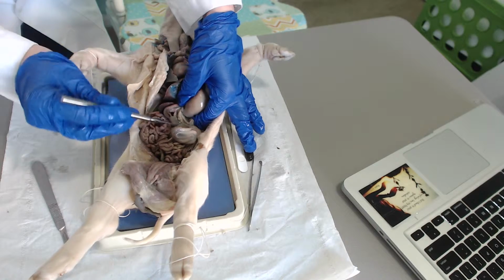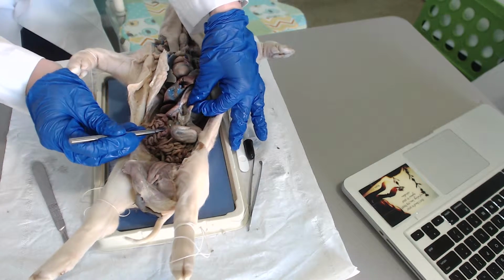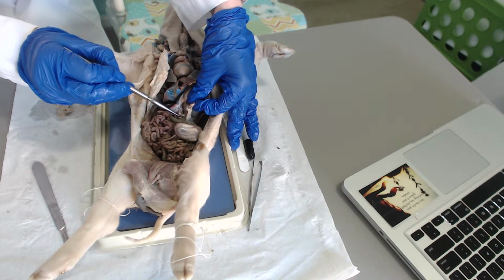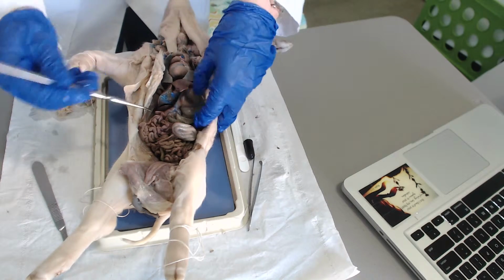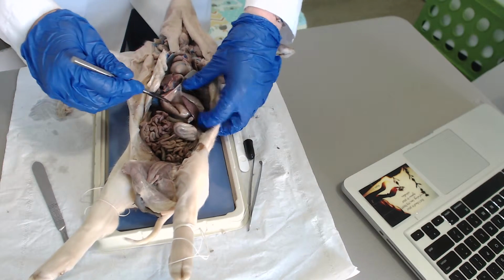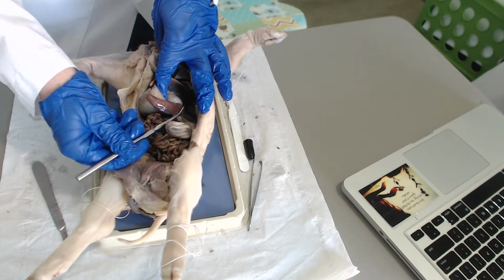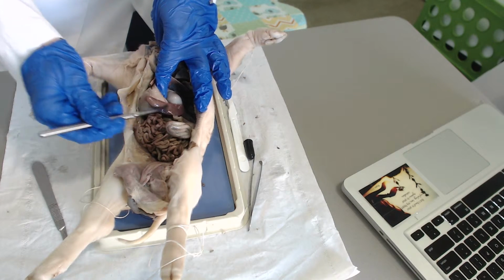Make sure you can see that. So the pancreas, you can see, is right here. That's the pancreas. Okay, once you pass the pancreas, we can also find the spleen, and it kind of wraps around back behind the stomach. So this very red area, this is the spleen.